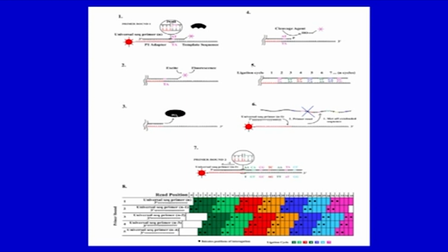The one which matches here will complement, then the gap here is filled in by the ligase. So, ligation is done. After ligation this is excited and fluorescence could be obtained for this, and then this is removed, unextended strands and other things will be removed.